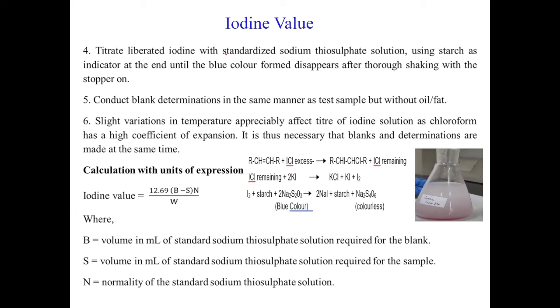Then the liberated iodine you will titrate with standardized sodium thiosulfate. You have to ensure that the sodium thiosulfate is properly standardized, which we do with potassium dichromate.